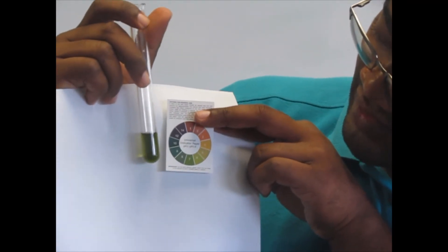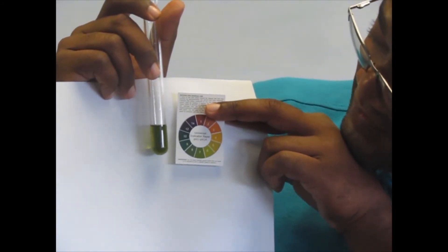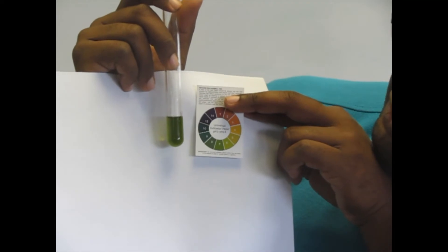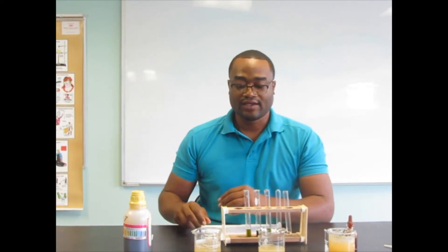The last sample here looks almost neutral, at a pH of 7 to 7 point something, now it goes to 8. So our soils here are fairly good to use. They are fairly around neutral and wouldn't need much amendment since most plants in the Caribbean thrive in soil types of 5 to 8 or 9.